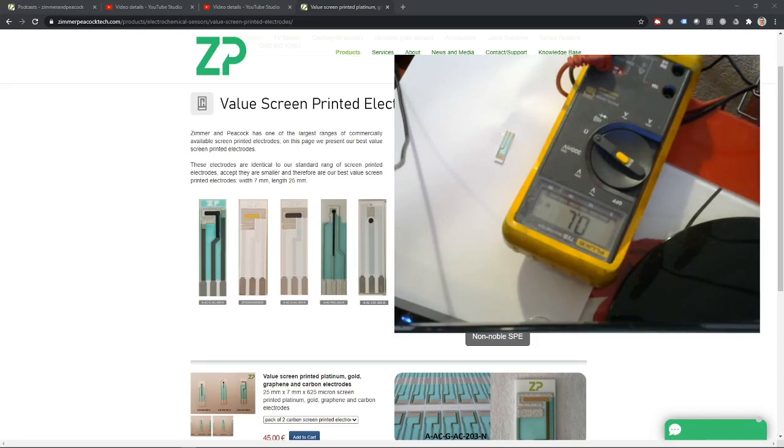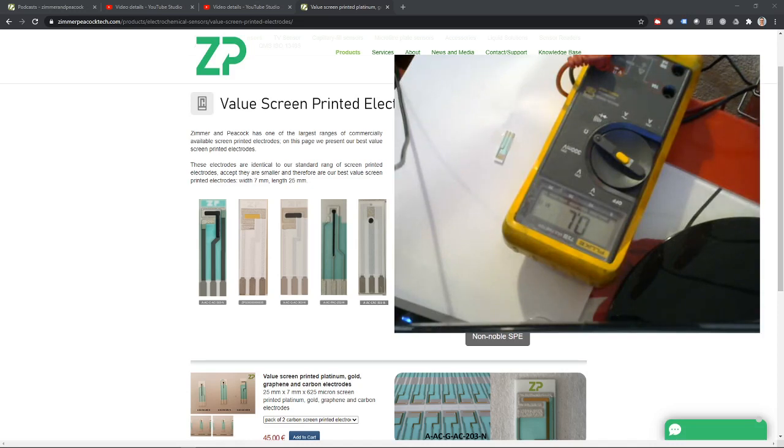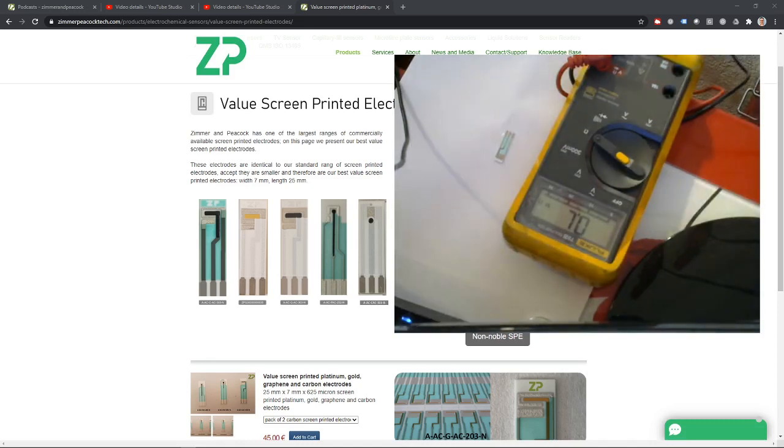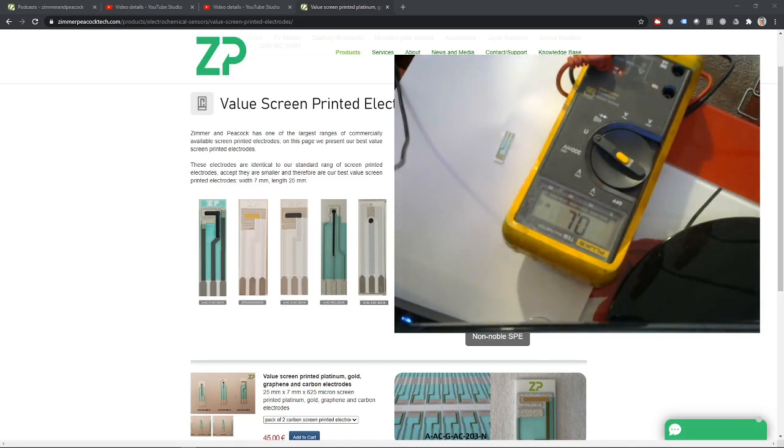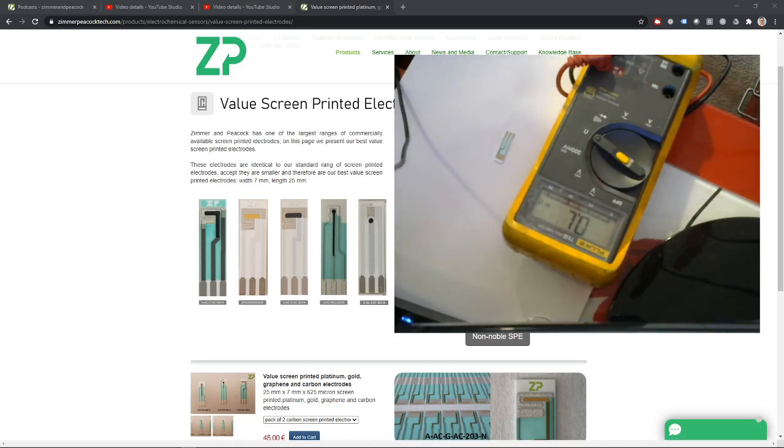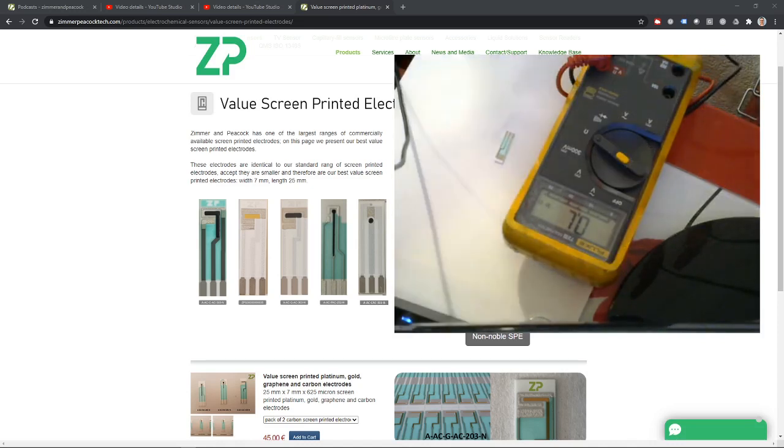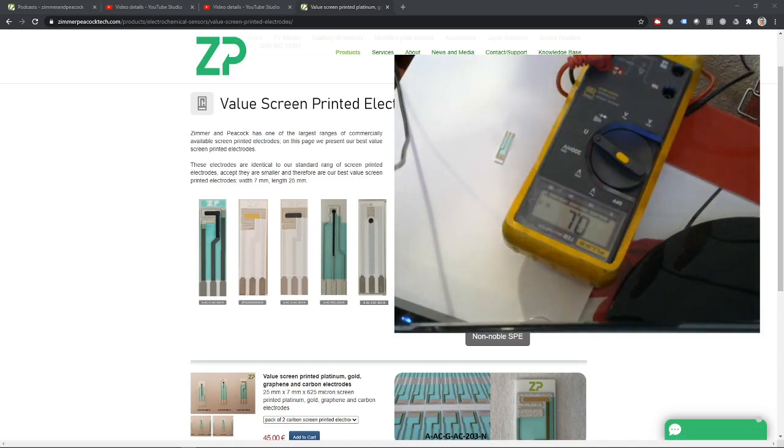I wish I had one of our gold 303 electrodes with me. Unfortunately, I've just got one of the gold 203 electrodes. The reason I like the gold 303 electrodes is because we make it in quite high volume. And when you make something in high volume, you can give people the benefits of the volume. The fact that we're making it in high volume means that we can give people the benefits of high quality and a good price.